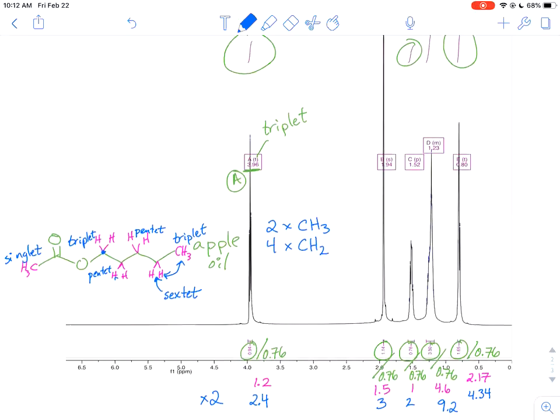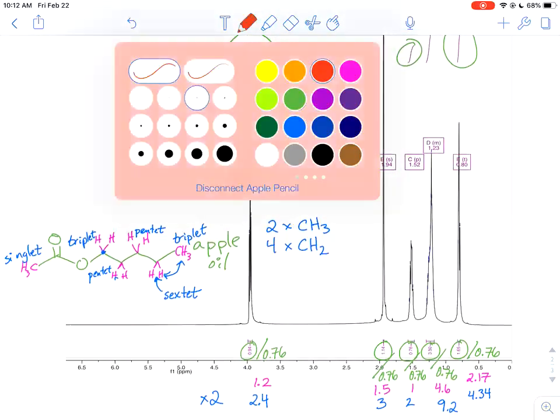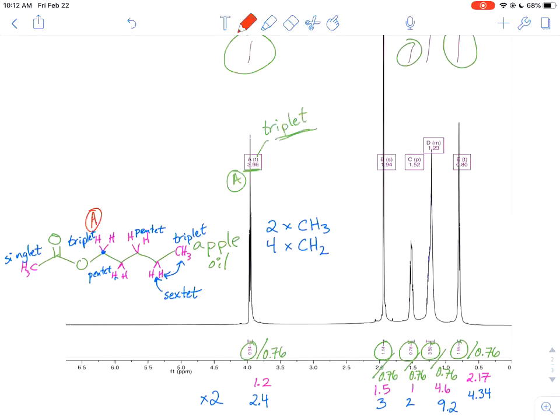Now, once again, we have our splitting patterns here. We have a clear triplet assigned what we're calling signal A. That's the most deshielded one. So this one must be over here, right? The one that's closest to the oxygen. We have this S right there. That's signal B. The S stands for singlet. That's given in the table. The only singlet that we expect in the molecule would be for the CH3 next to the carbonyl. And then we have other clear patterns of a triplet. This is the most shielded triplet. That's signal E. In this case is going to be that terminal methyl group.